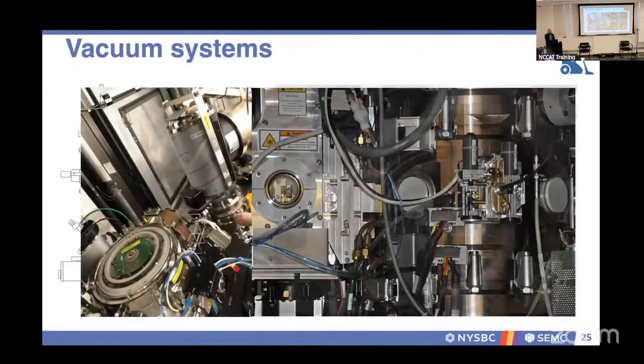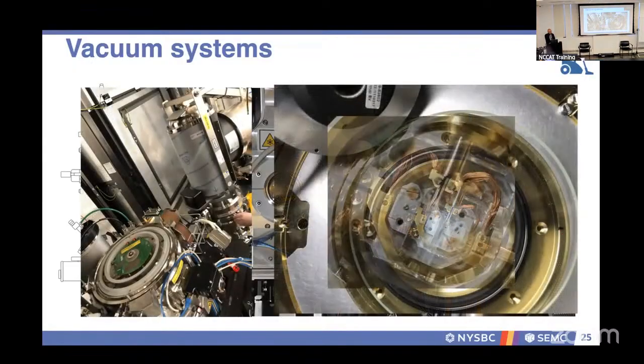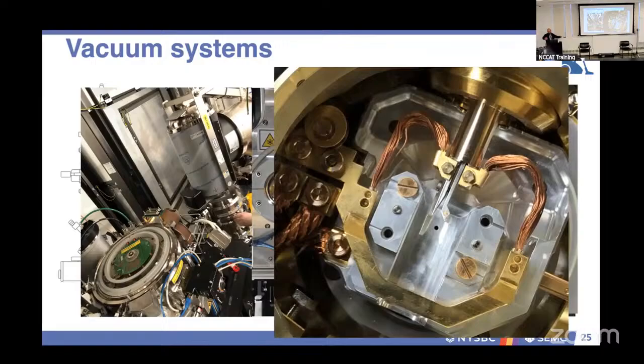Right. And something that people don't tend to think about, you can see such a large column. Lenses are basically this big donut around this size. There's a lot of lead shielding, but the column proper, so what we're seeing is the octagon on the right. If you see that little dot in the middle where the sample is, that's really the column. And you can think about it, if you had the ink from your pen, that's roughly the diameter of the column when it's going through, where the electrons are going through.